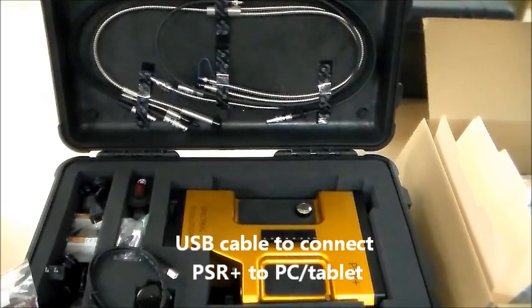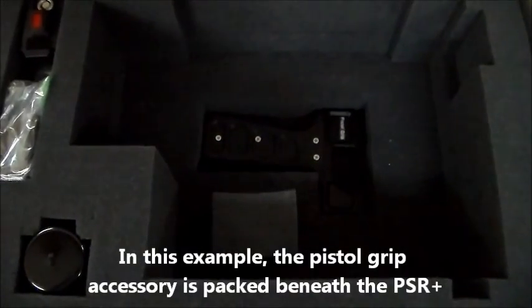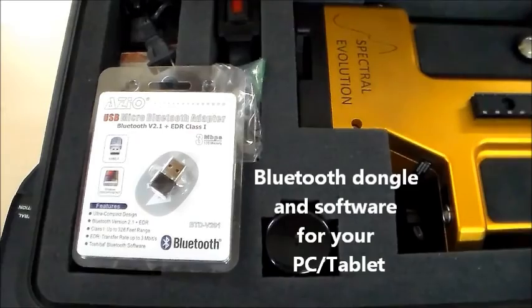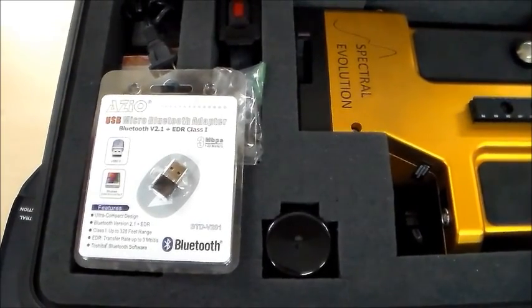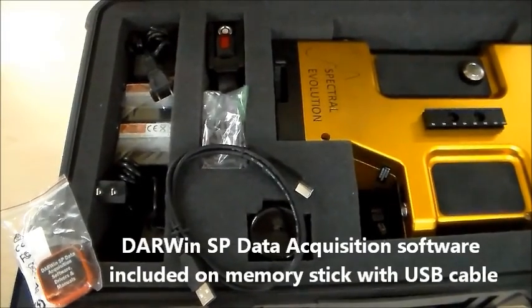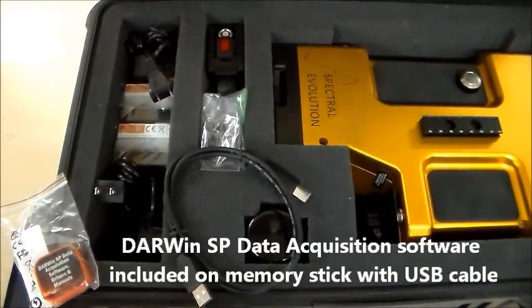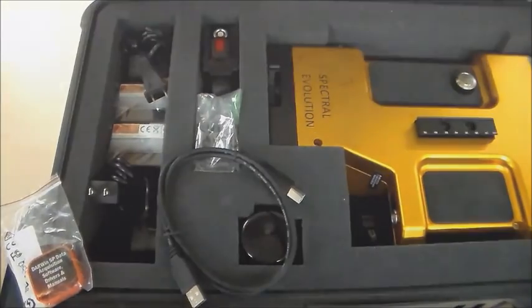You can also see a USB cable to connect the instrument to a laptop or tablet. Lift out the PSR Plus and underneath is packed the pistol grip accessory. We include a Bluetooth dongle for use with your PC along with its driver software. The Darwin SP Data Acquisition software is also included on a memory stick, along with a USB cable to connect your GTAC handheld microcomputer to your PC or tablet.